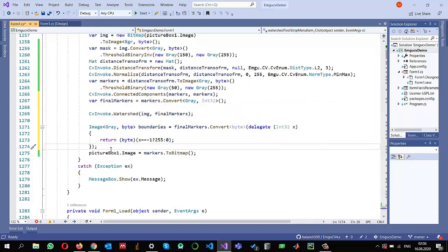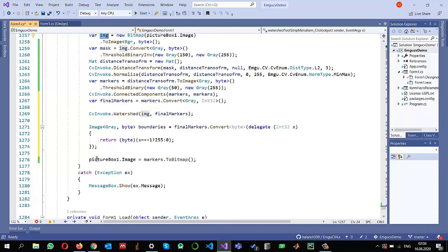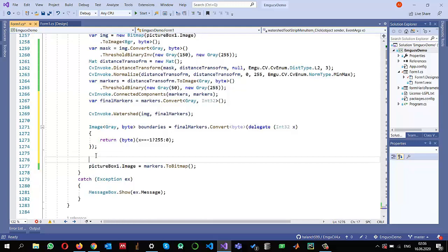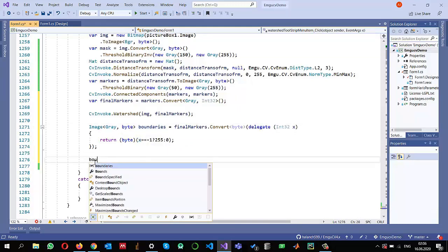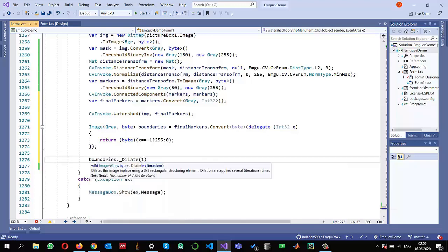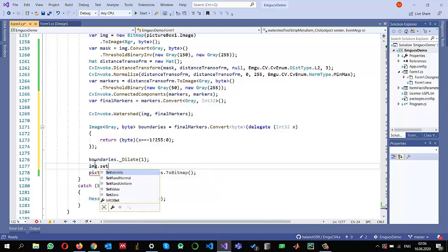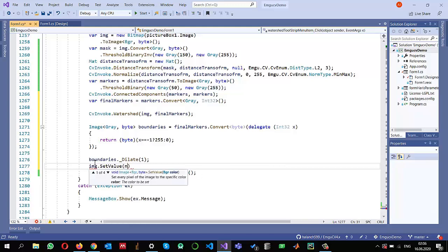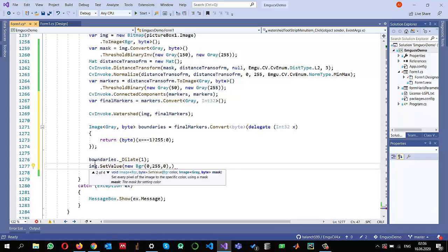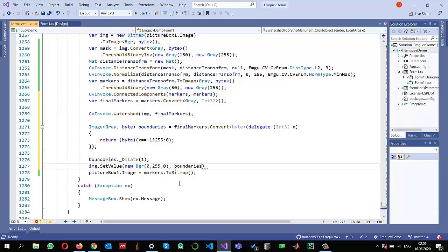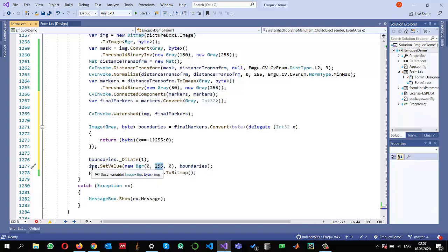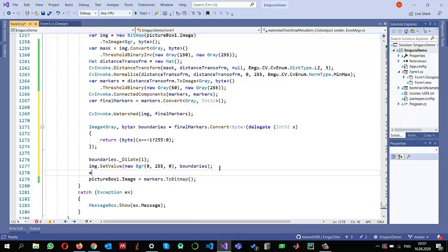Once I have the boundaries of the segmented objects, I draw them on the original image. I dilate the boundaries once using `boundaries._Dilate(1)` to make them slightly thicker and easier to see. Then I call `img.SetValue` with a green color (blue=0, green=255, red=0) and pass the `boundaries` image as a mask, so only pixels where boundaries are 255 get set to green.